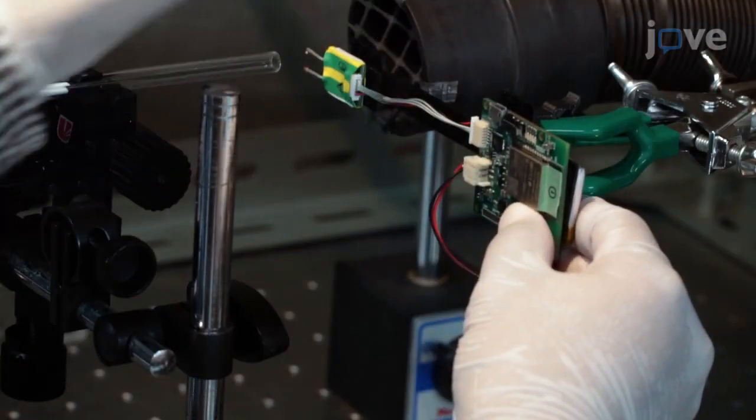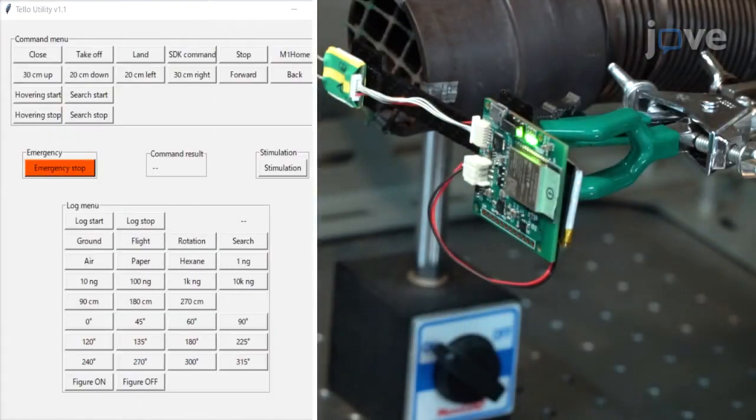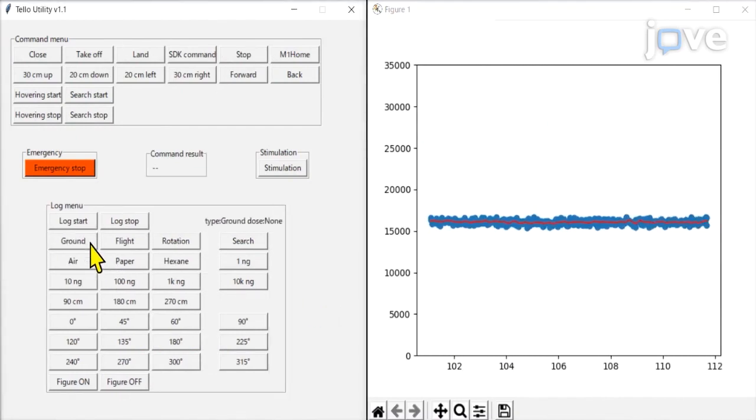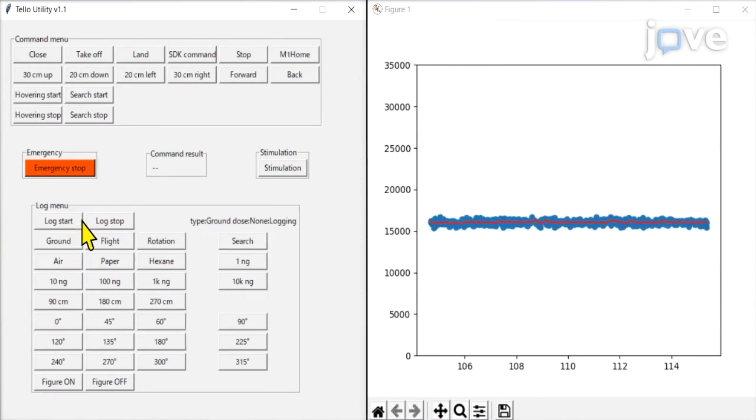Switch on the EAG device. Then run the data acquisition program on the PC. Press the ground button in the log menu to decide the experimental state, and then press the log start button for data acquisition.